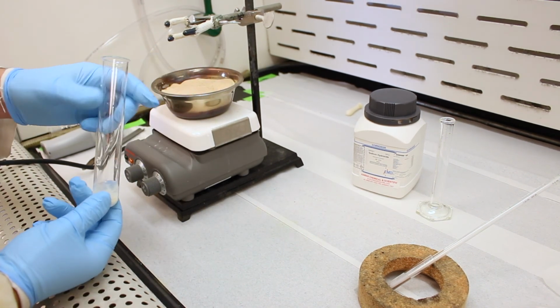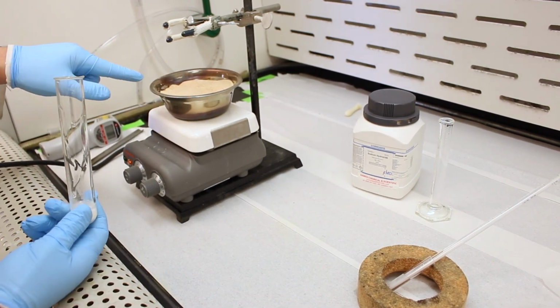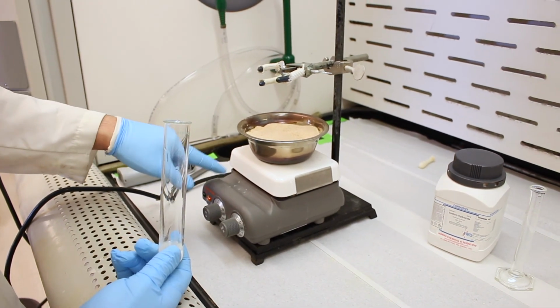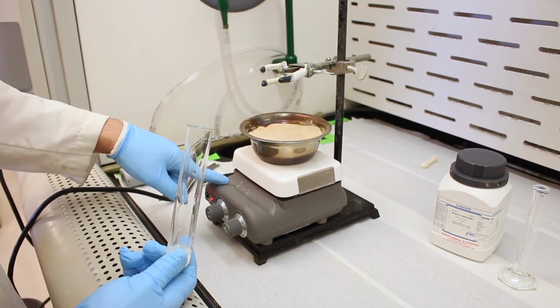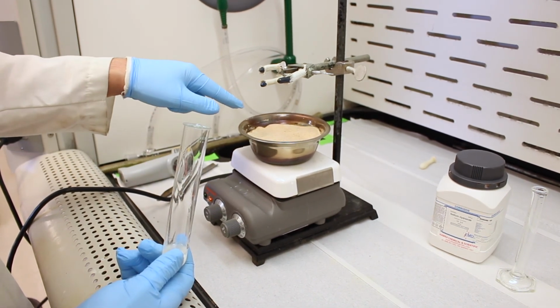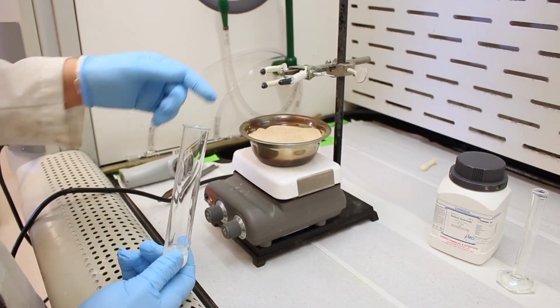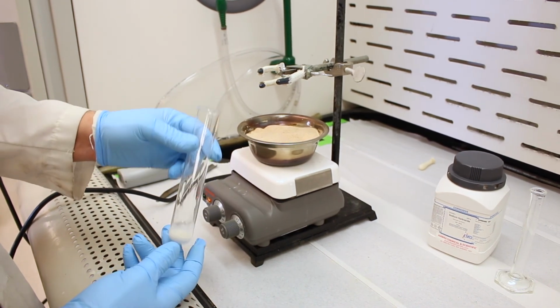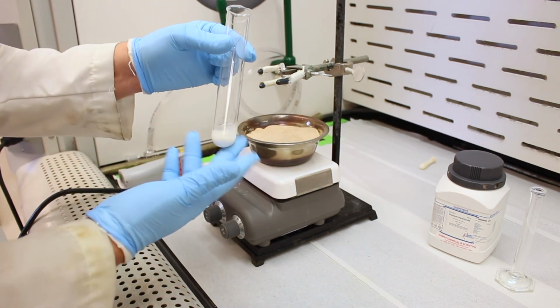Now, the heat for this reaction is supplied via a sand bath, and that's because the temperatures required for this reaction are very high. When you have a double dehydrohalogenation, you need very high temperatures to get the reaction to go. And this sand bath will supply the heat. A sand bath is very good at retaining heat, so there's a lot of thermal mass in the sand, which we will submerge this test tube into.